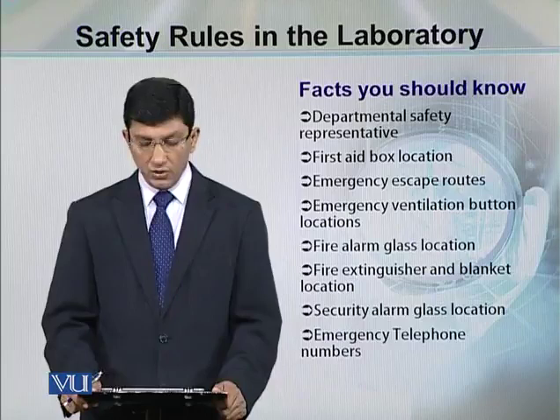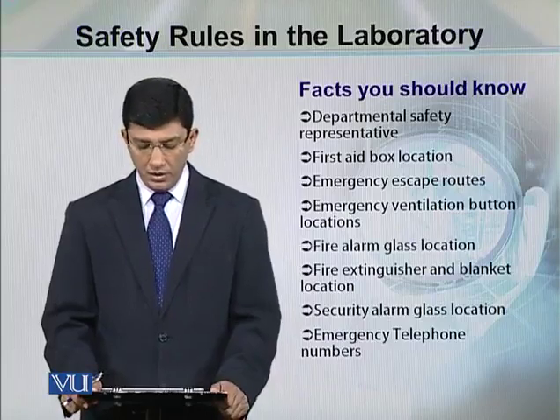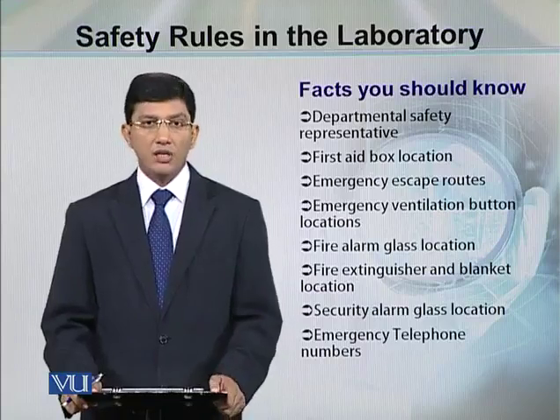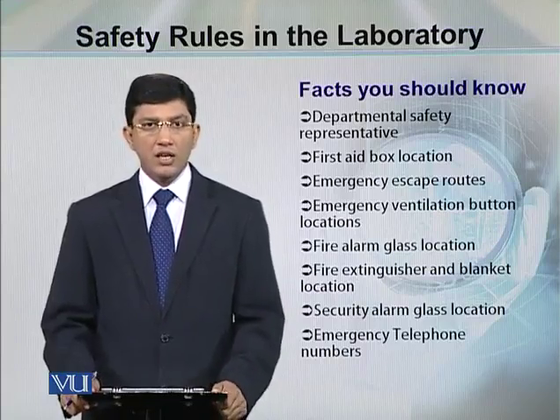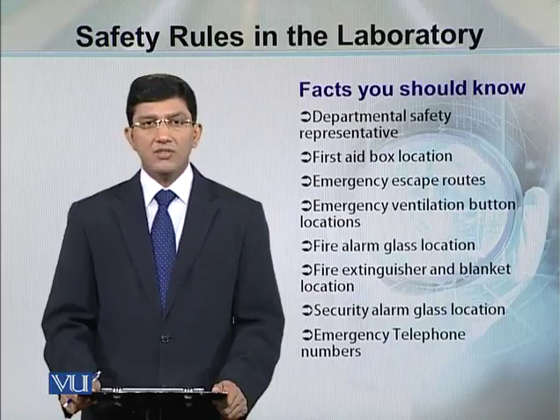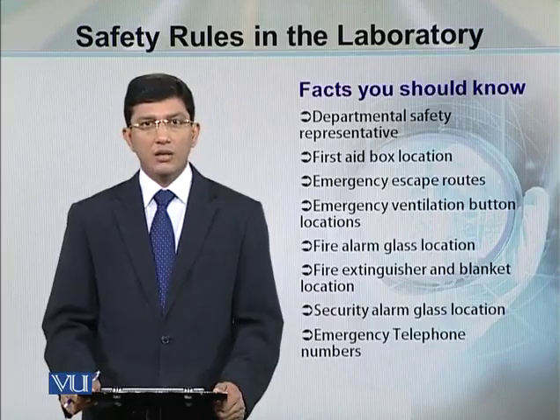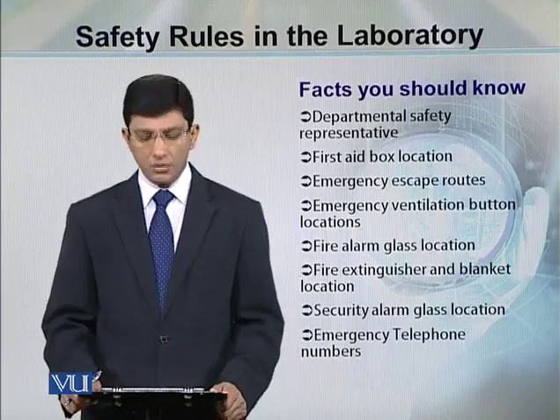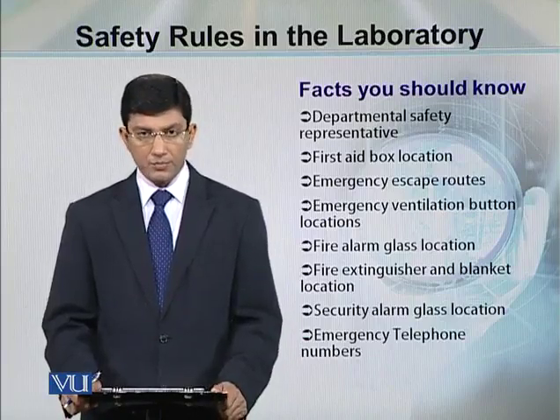You should be familiarized of the building, of the escape doors. In case of emergency, you have to leave the building. There should be idea about emergency ventilation button locations. In case if there are some gases leaked in the room and you are not in a position to leave the room, you should switch on the exhaust system of the building.